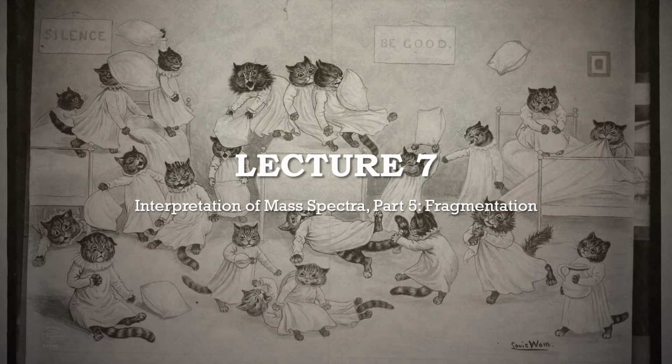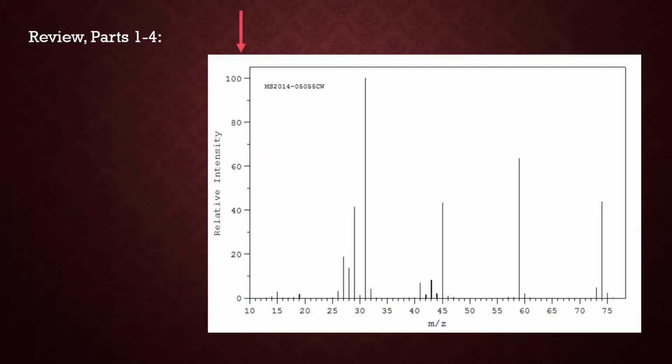Anyway, this is lecture 7, part 5, and I'm going to refine our interpretation of mass spectra by looking at the fragmentation patterns that appear and describing how they will be used to piece together the molecule in a retrosynthetic fashion. But first, let's review parts 1 to 4 in a relatively straightforward, instructive manner by supplying a step-by-step interpretation guide.